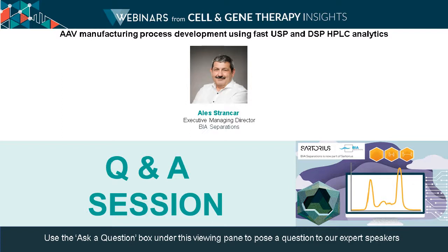Brilliant. I'm sure we can follow up later with more precise numbers as well. Can these analytical columns be reused, and if yes, how many times?